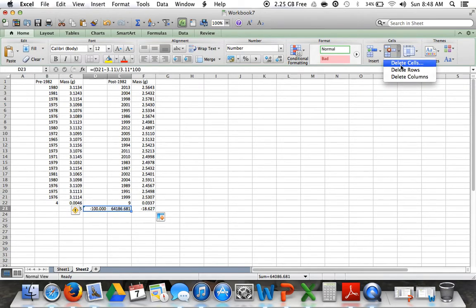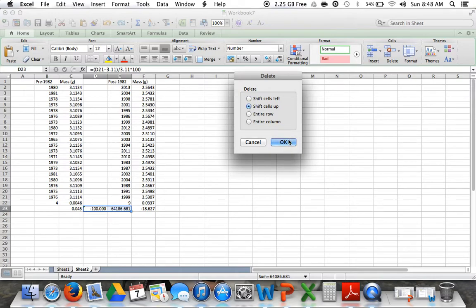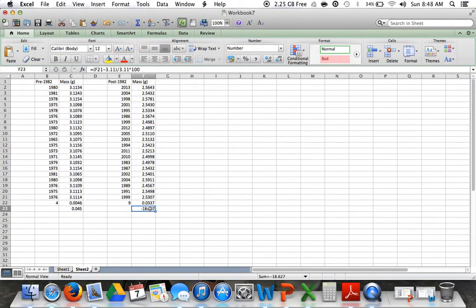All right. Shift cells up. So this shouldn't be 3.11. The number should be, I keep wanting to ask questions like Dora the Explorer, like what should the number be? You guys can't respond in a video lecture. All right, so this is 1.28228. All right, so now it recalculated our input value as F21. So now just make sure that that's true. Yeah, that's F21. We subtracted it from 2.5 because that should be our theoretical value.